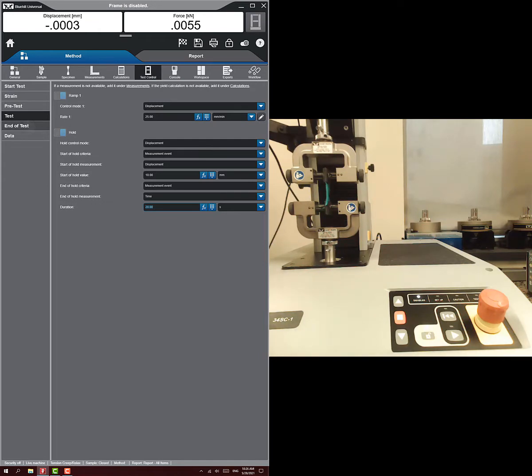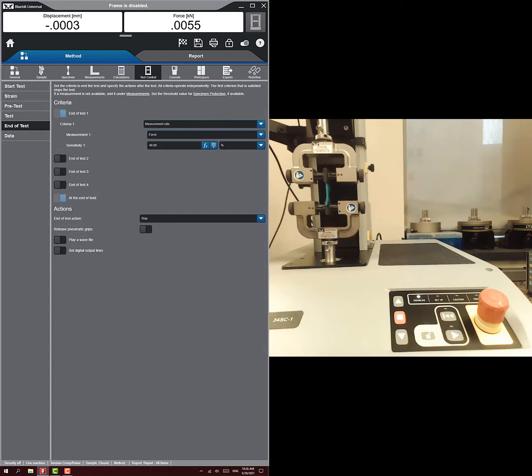End of test - really, we don't need to do a hold time here. It's already selected to do this. When it breaks, it's going to end, and at the end of the hold, it's going to end.